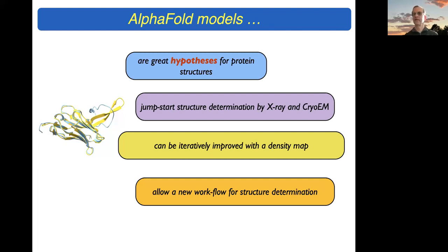Okay, so is this approach, AlphaFold, rebuild, AlphaFold, rebuild, better than traditional refinement for X-ray structures? Molecular replacement, rebuild, find, rebuild, find. The answer is yes and no. Let's suppose you have a highly refined X-ray structure, a 2 angstrom structure.